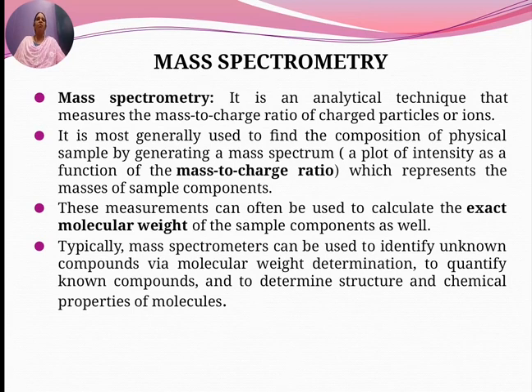So, mass spectrometry is an analytical tool that measures the mass to charge ratio of charged particles or ions.